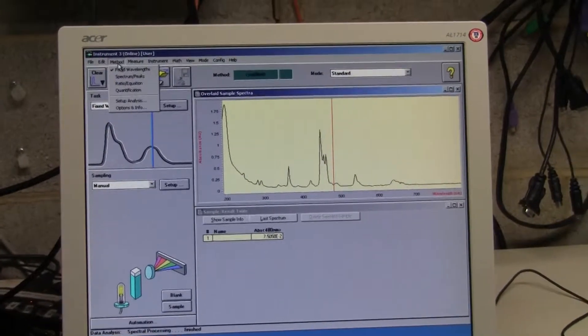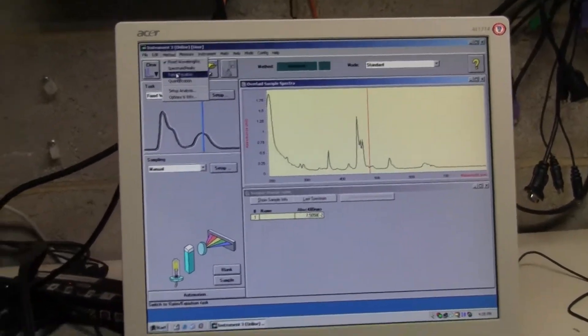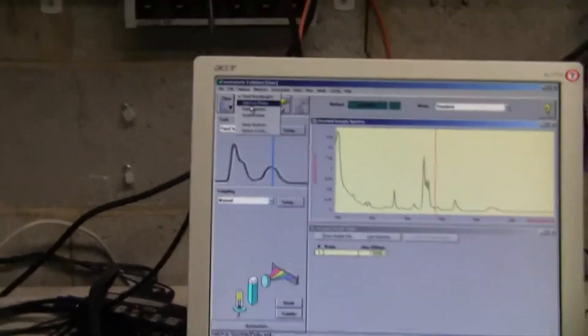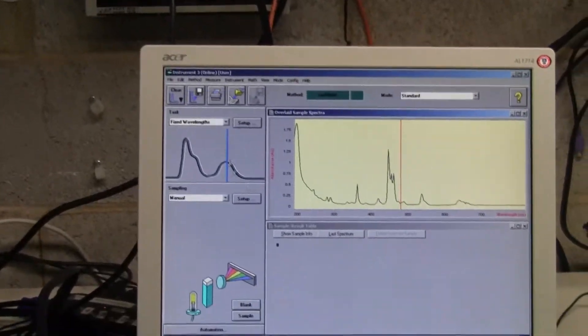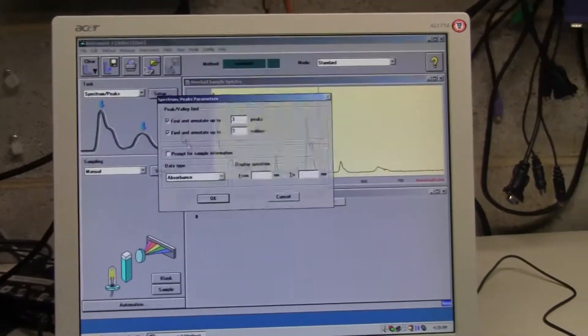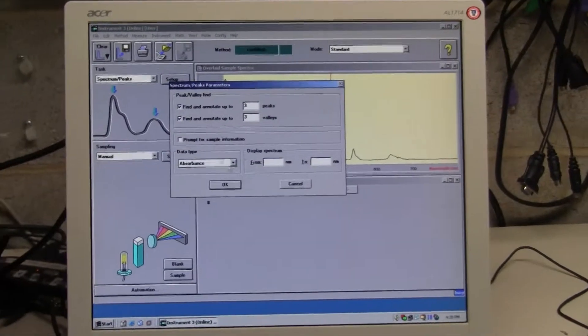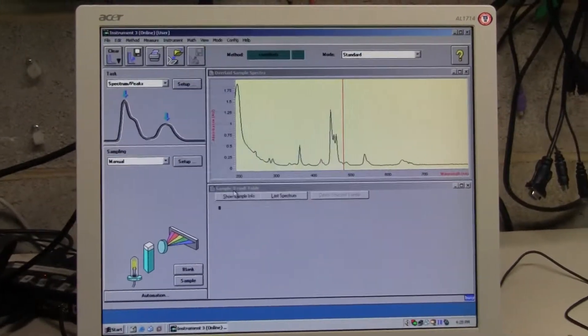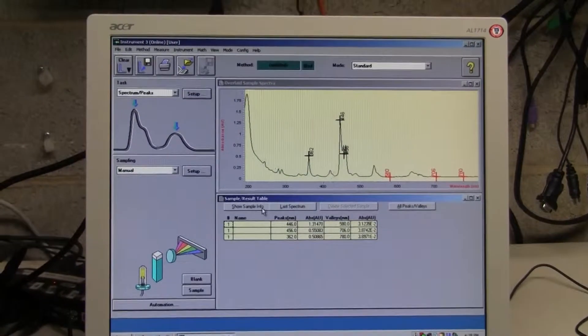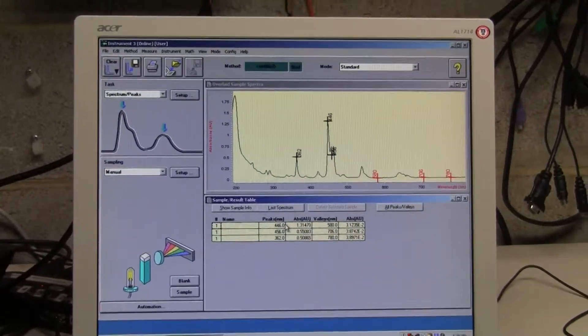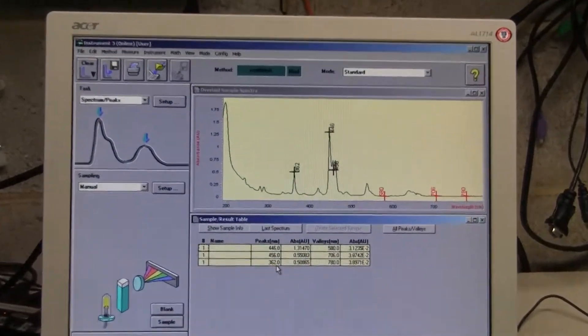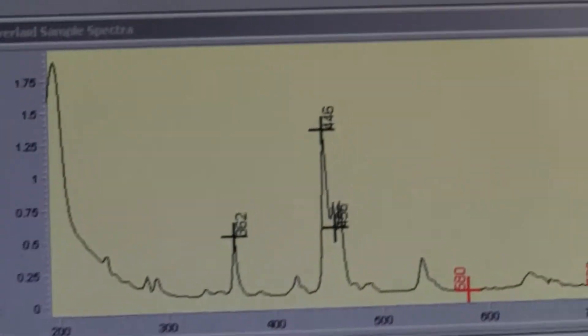Method, we can look at spectrum and peaks. And there are your peaks, all within specification.